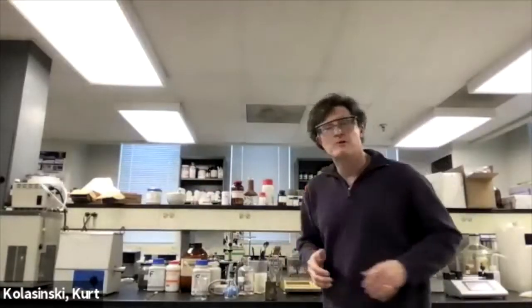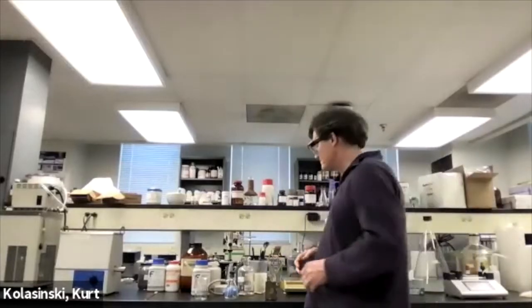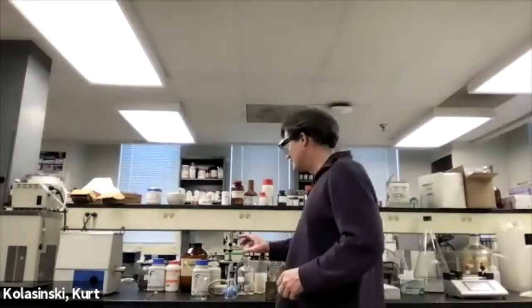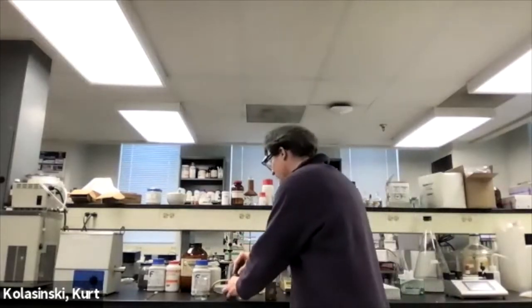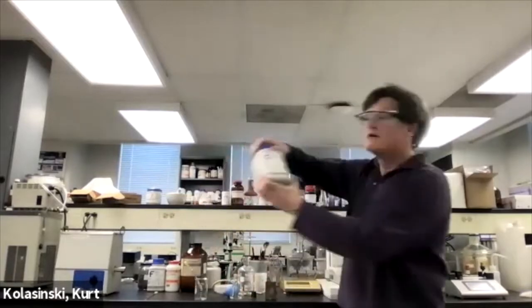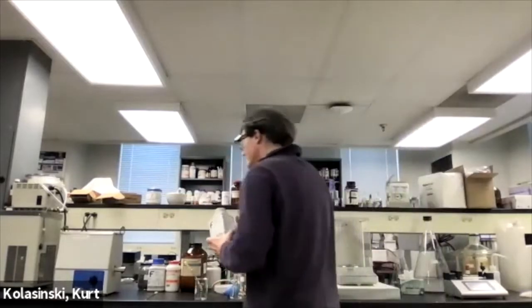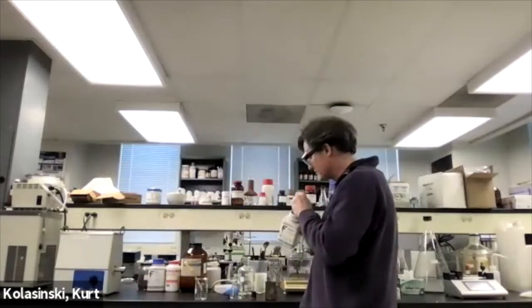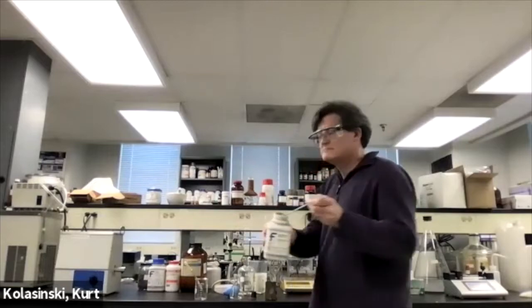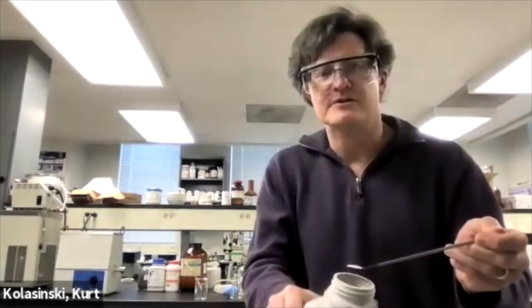But now what we want to do is generate some HCl, right? And generally you do this in the fume hood. But I don't have a good angle for you to see in the fume hood, so I'll be sticking this in the fume hood presently. We don't want to generate a lot of HCl. How are we going to do that? We need some sodium chloride. Really, just take a little bit of sodium chloride.